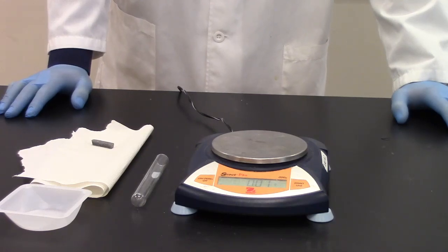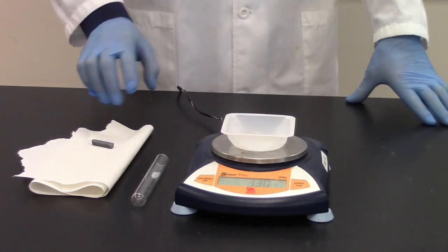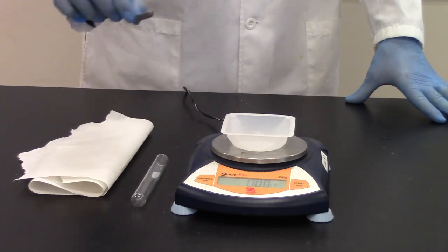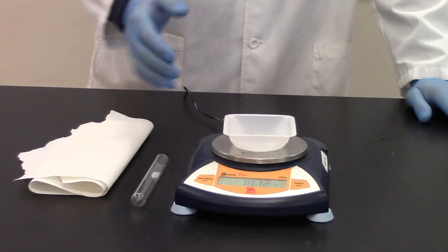My next step is to get a mass of our metal. So I'm going to begin by putting our weigh boat on the balance and I'm going to zero that out. Next I'm going to place my sample on the weigh boat and I'm going to record the mass.